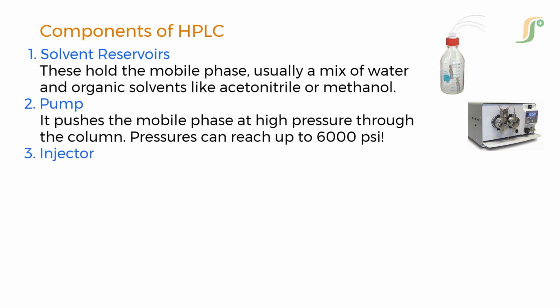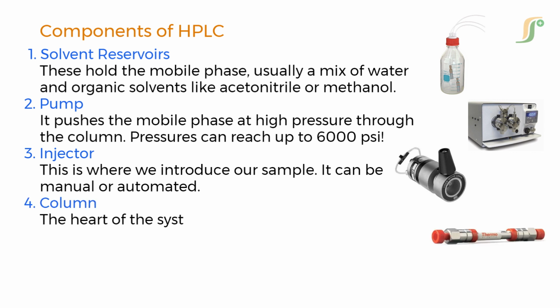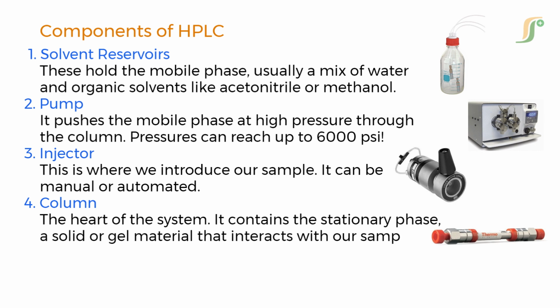The third component is injector. This is where we introduce our sample. It can be manual or automated. The fourth component is column, the heart of the system. It contains the stationary phase, a solid or gel material that interacts with our sample.